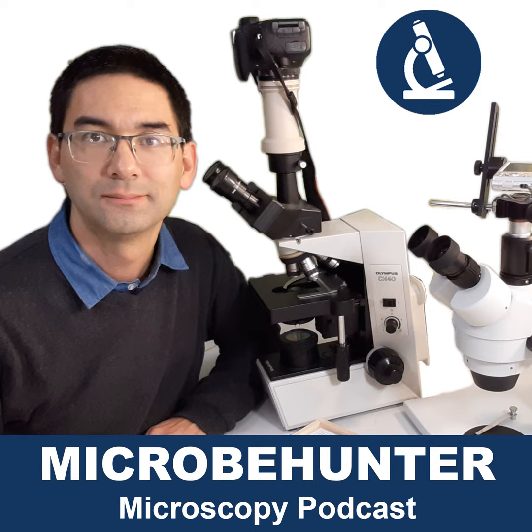Having said that, simply because a microscope has a 160mm system does not automatically mean that the image quality is any worse. Modern 160 millimeter objectives are of course manufactured, and they are used very widely in the educational and in the amateur sector. So these are not outdated objectives.